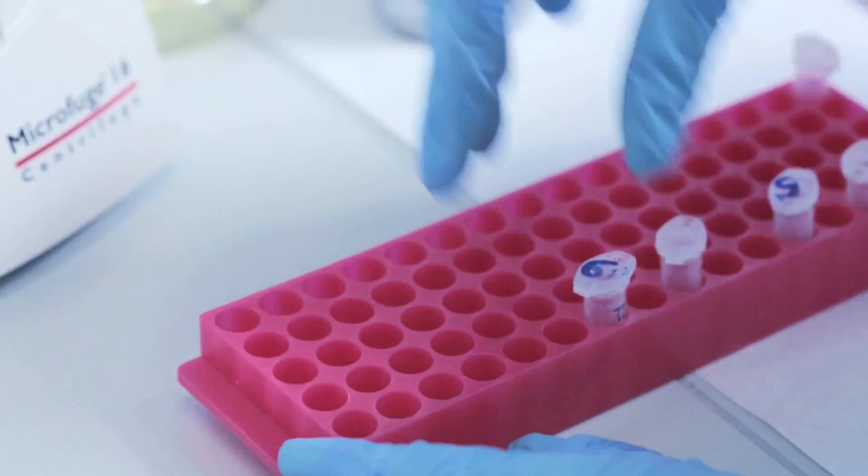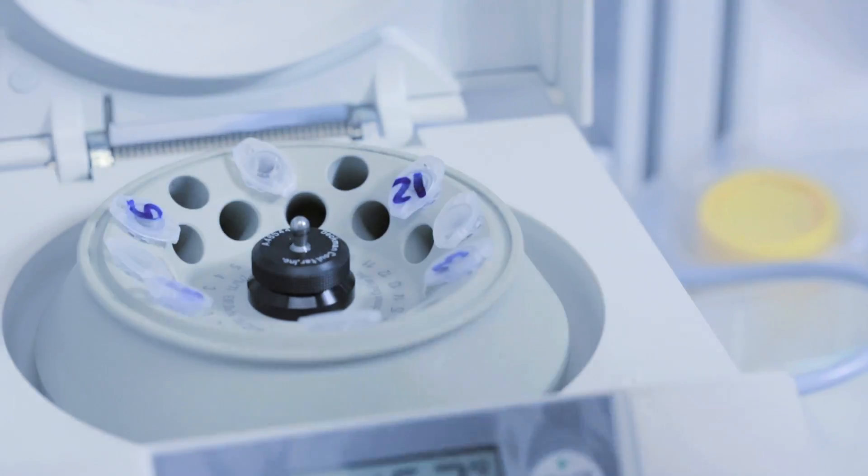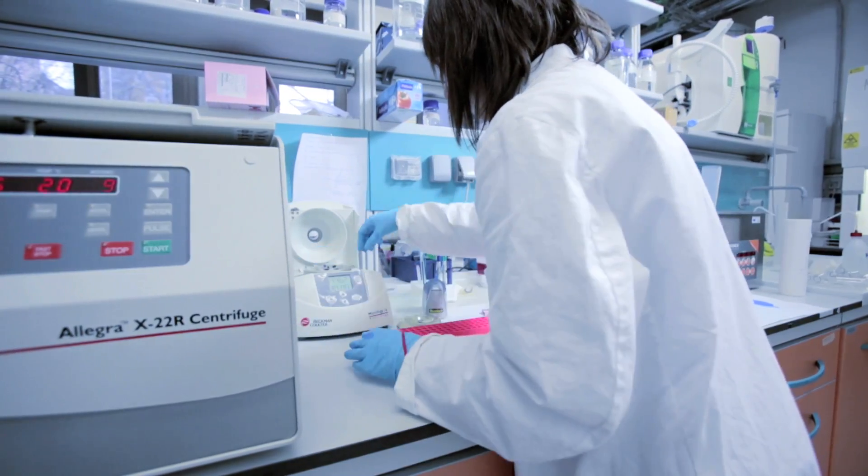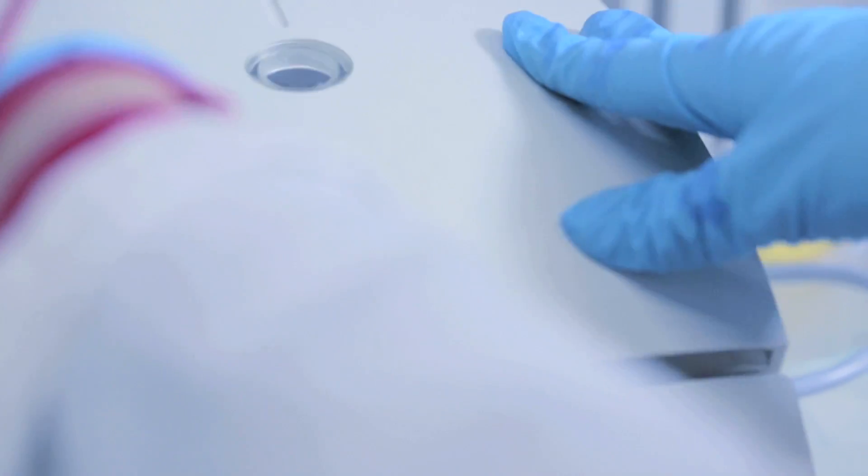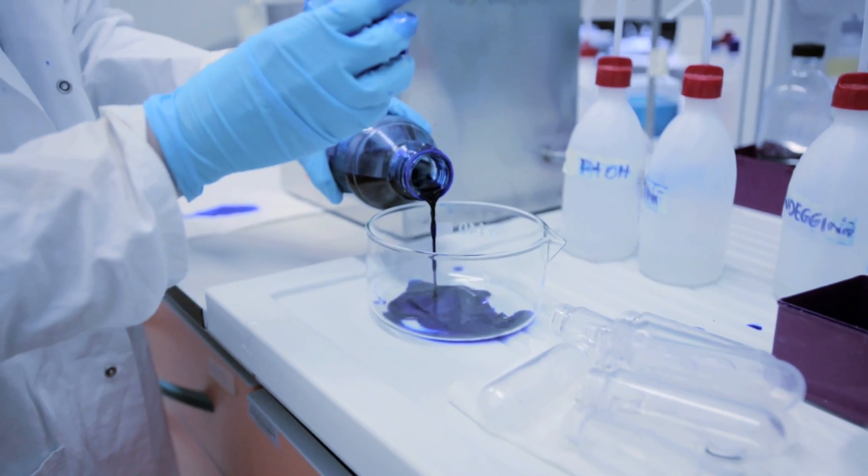After sonication, we can centrifuge our sample in order to separate the soluble fraction from the insoluble fraction. The protein of interest is present in the soluble fraction. Then we can load our sample on an SDS gel to check the band corresponding to the protein that we are studying.